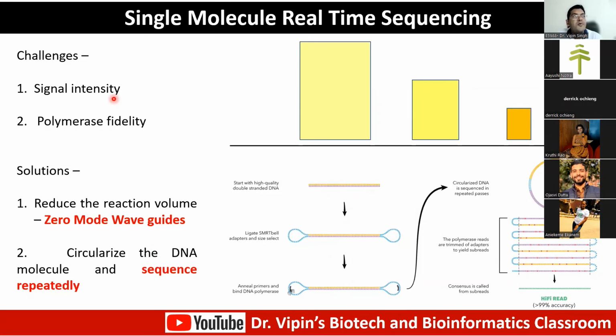And how do you compensate for that? Because that could also be an artifact or a complication. For that, you use a very simple idea. Let's say you have a 40-watt bulb and you place it in your drawing room, which is the largest, then in your kitchen, and then in your bathroom, which is the smallest. The intensity of light will be the largest in your bathroom because the area that it is covering is very small.